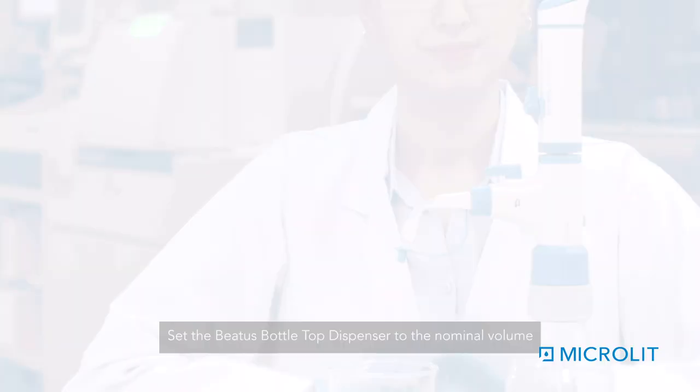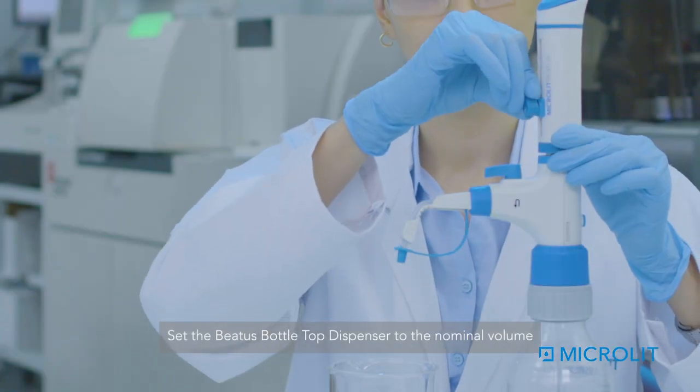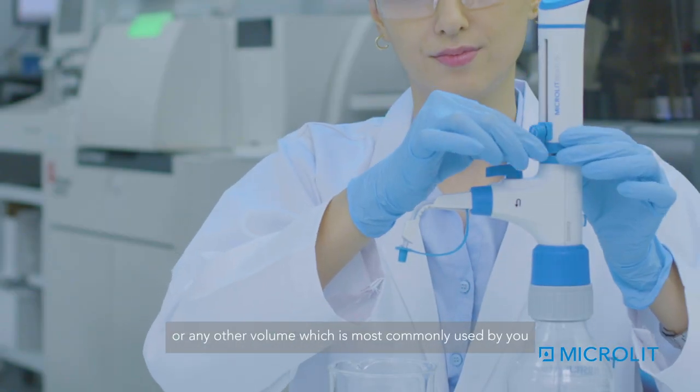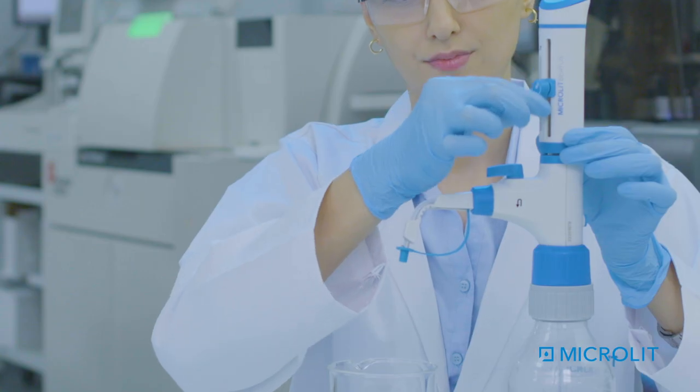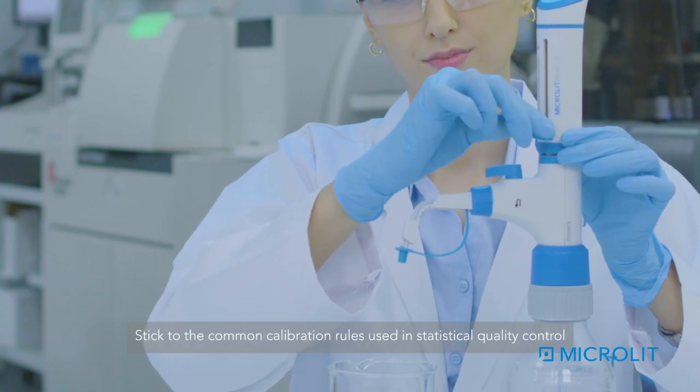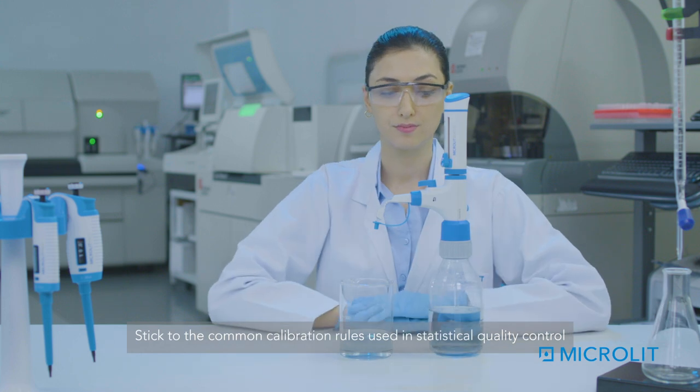Recalibration. Set the Beatus Bottle Top Dispenser to the nominal volume, or any other volume which is most commonly used by you. Stick to the common calibration rules used in statistical quality control.